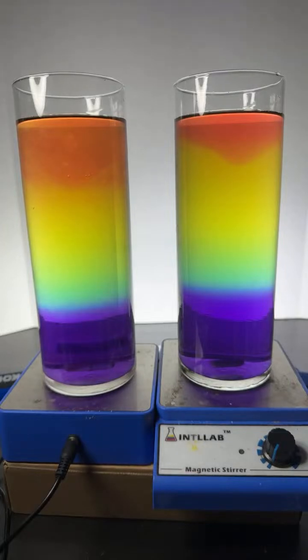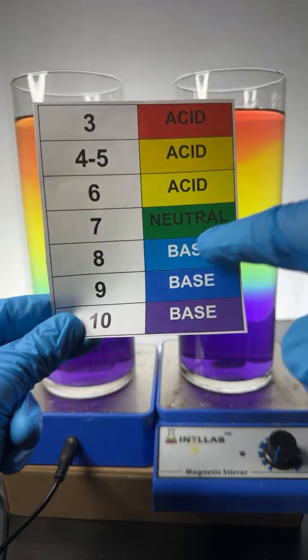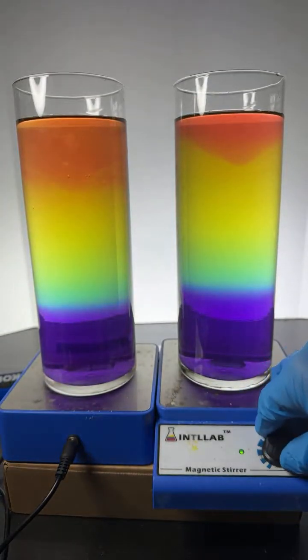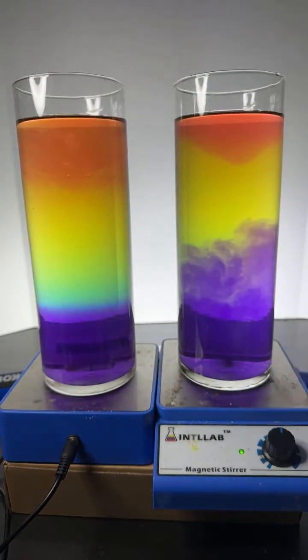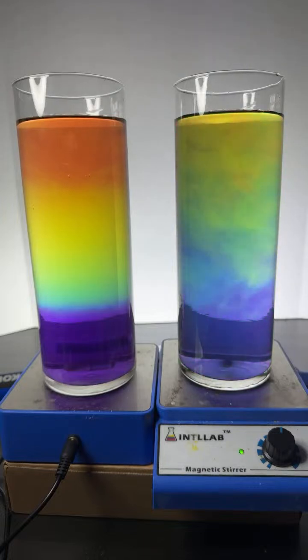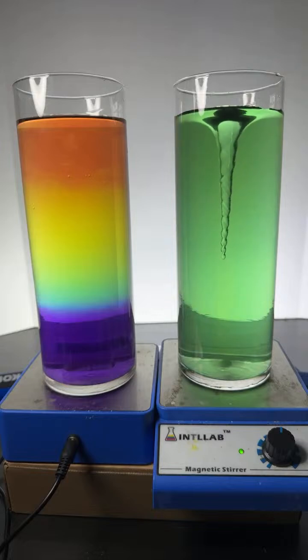It's crazy. Absolutely crazy. All right, I'm going to mix them now. As I mix these, if the concentration of acid and base are the same, then we will neutralize it and we'll see a green color. If there's more base, we'll see one of these colors. If there's more acid, we'll see one of these. Let's see. I'm thinking more base, but perfectly neutralized, maybe a little bit acidic.